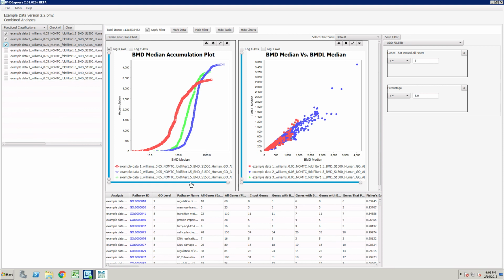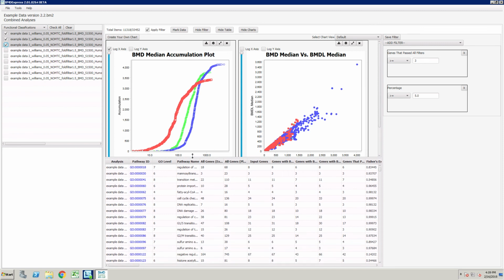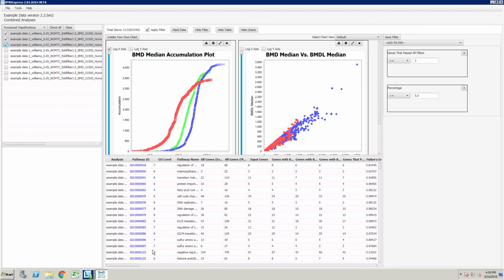These are parametric dose response curves that come from the EPA BMDS software. We then partition those genes with adequate fits into gene sets, and then determine a number of different values for estimating the potency of that gene set. And that's one thing I didn't touch on here.